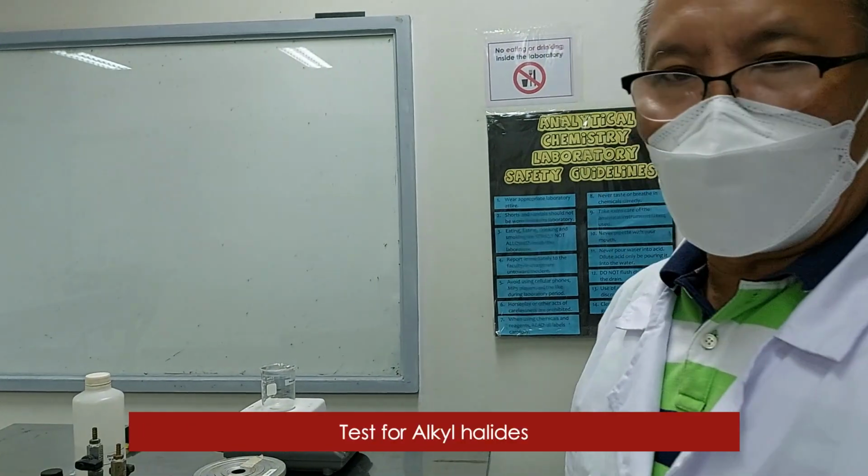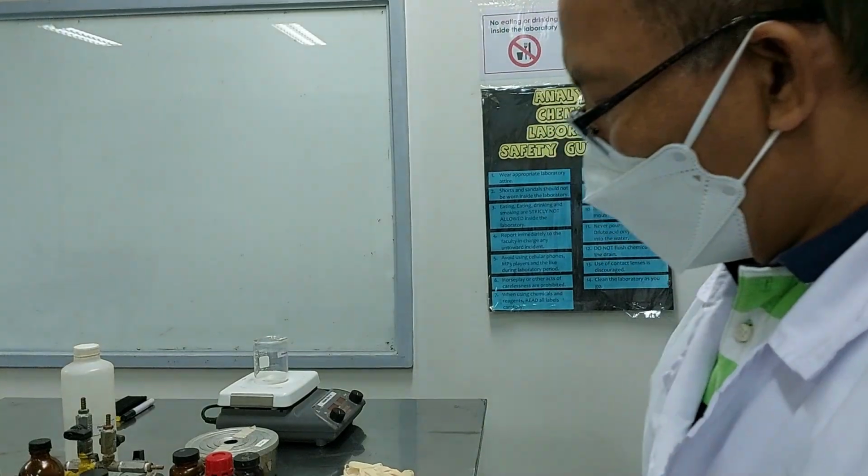Now let's go to test for alkyl halides. Okay, so you know alkyl halides have halogens. Okay, so how can we identify alkyl halide? One important reaction for alkyl halide is the reaction with silver nitrate.